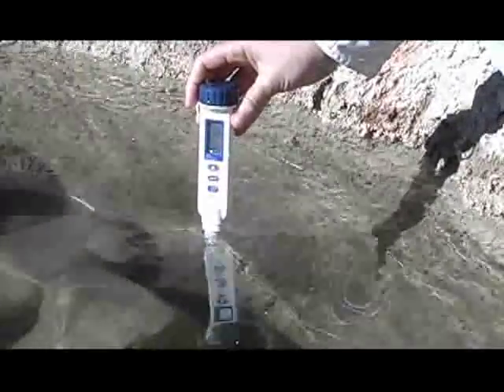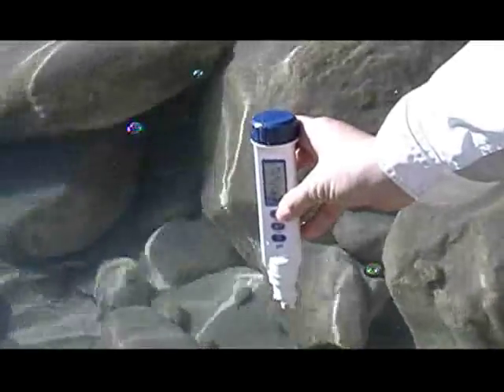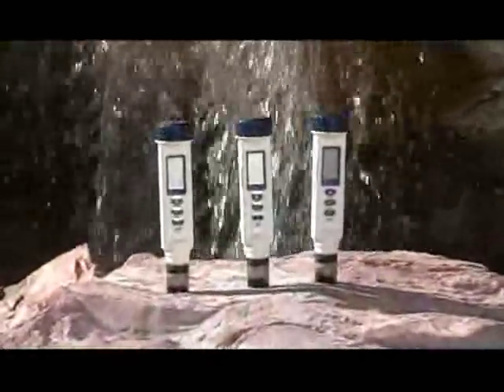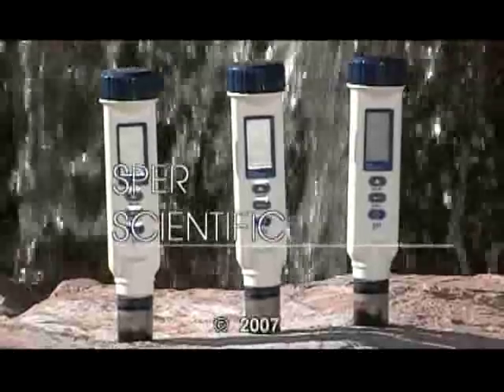Features a large, easy-to-read display that indicates when batteries are low, comes with four button cell batteries, and a built-in pH electrode kept moist by a protective watertight cap. Available exclusively from Sper Scientific.